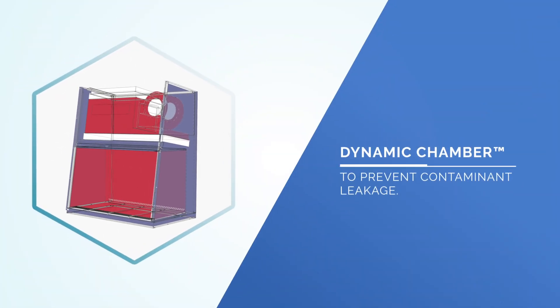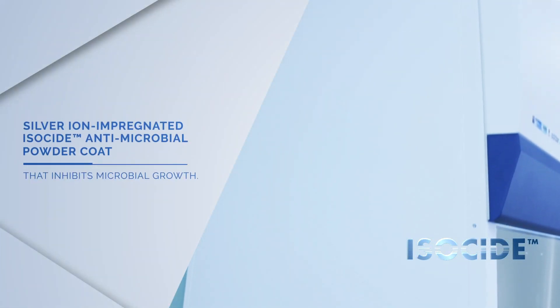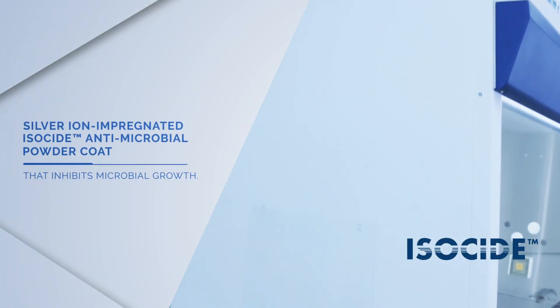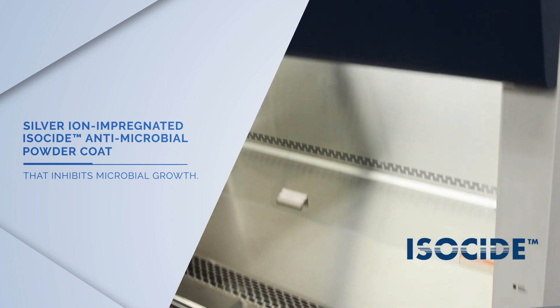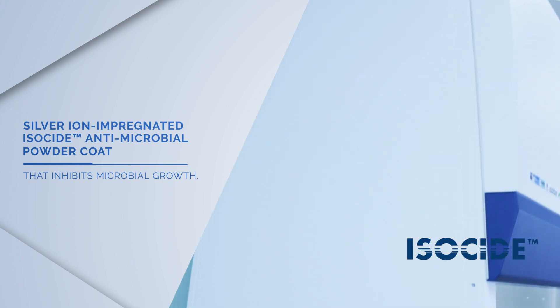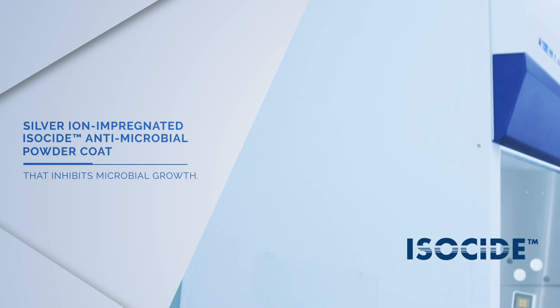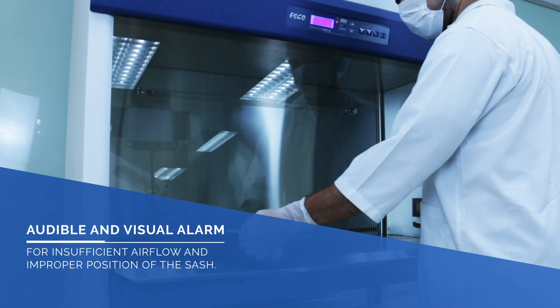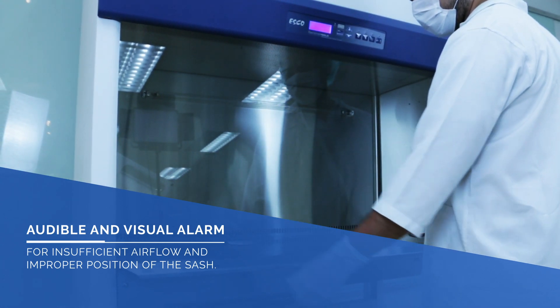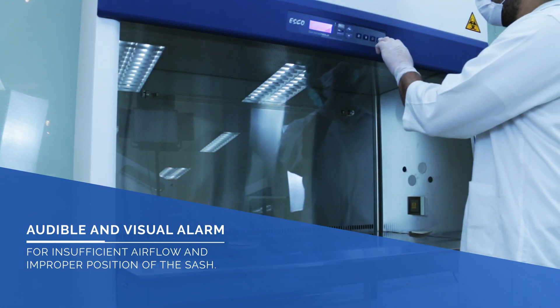Dynamic Chamber Technology helps prevent contaminant leakage. Esco's Isocide antimicrobial powder coating eliminates 99.9% of surface microorganisms upon 24 to 48 hours of exposure. There are audible and visual alarms in cases of insufficient airflow and improper position of the sash.